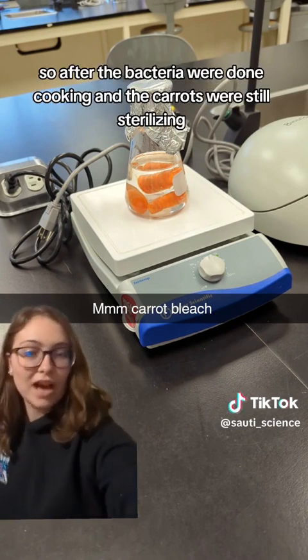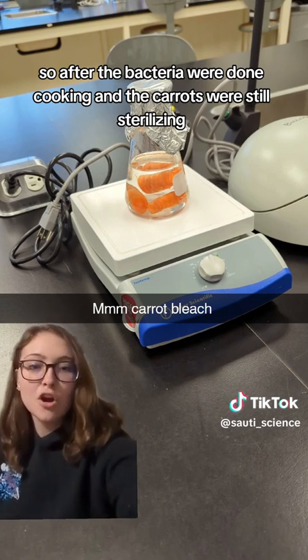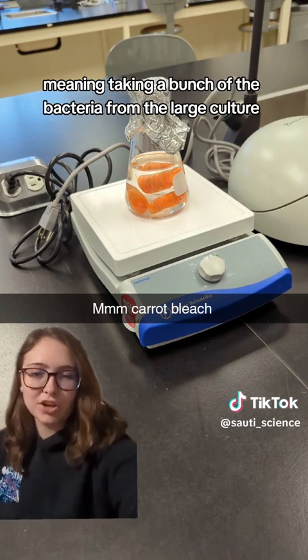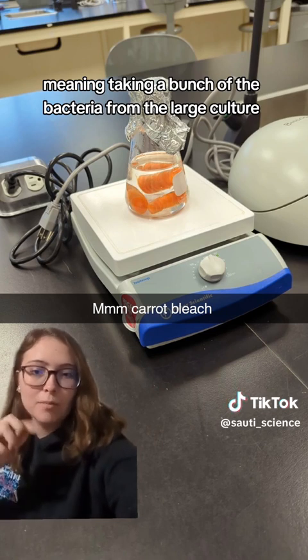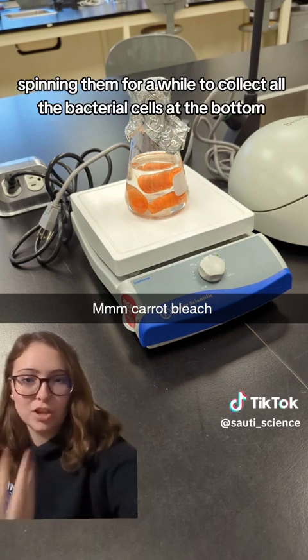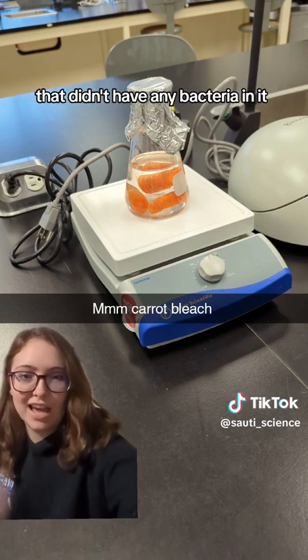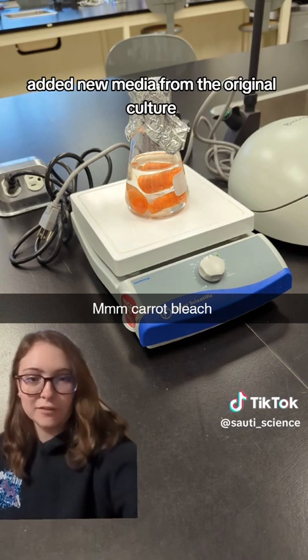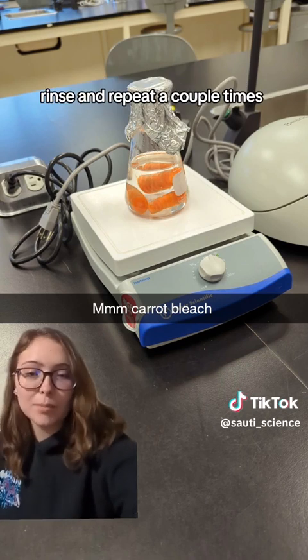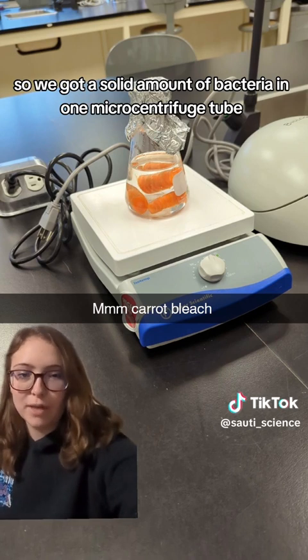After the bacteria were done cooking and the carrots were still sterilizing, we had to concentrate the bacterial cells — meaning taking a bunch of bacteria from the large culture, putting them in centrifuge tubes, and spinning them to collect all the bacterial cells at the bottom. Then we discarded the leftover media, added new media from the original culture, spun it again, and repeated a couple of times until we had a solid amount of bacteria in one microcentrifuge tube.